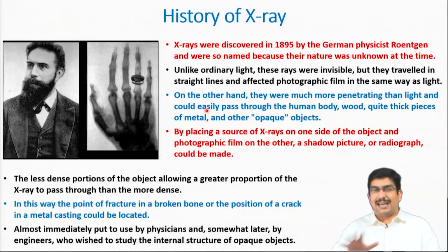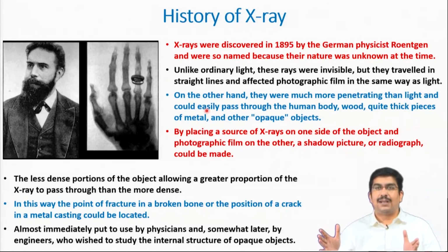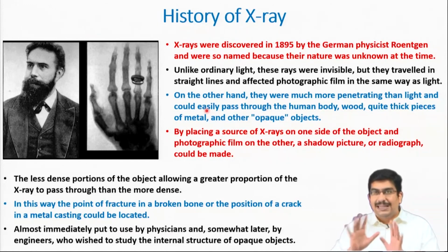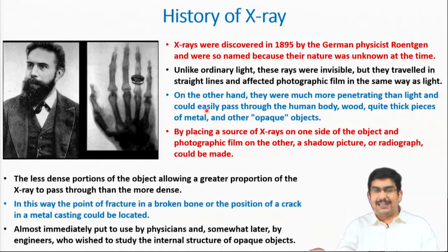And then you have XPS, which is a spectroscopy mode, and that spectroscopy mode is capable of giving you elemental composition and much more information related to bonding and so on. But still, none of these 3 or 4 different X-ray based techniques could, till today, be combined in one single equipment. That is why electron microscopy is in some sense superior: it can give you chemical identity, whatever the scale. Of course, the scale is not as good as X-ray, but it has the added advantage that it can give that signal with a spatial resolution.